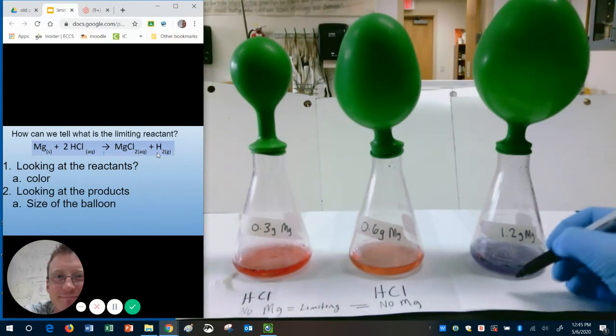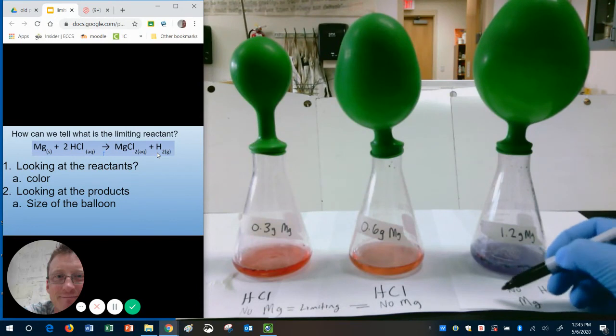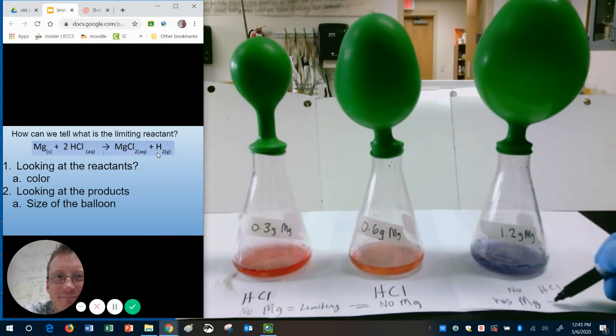So, this tells us in these two containers, magnesium must be the limiting. Because if it runs out, there isn't any of that left over. And in this one, it's the exact opposite. There's no HCl left, but there must be some magnesium left in there. So, this, then, is the excess.